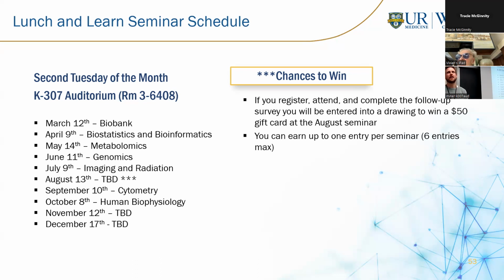We're actually working with a study with Dr. Anna Weiss, looking at circulating tumor DNA in breast cancer specimens, right? So similar idea, we collect the blood, and the DNA's in there, so we have it. Circulating tumor cells are a bit different. We would have to process them the day of, but again, we want to support the research, right? So you tell us what we should be doing on a day-to-day and how we should be building our collection. The more I hear that, the better I can do.